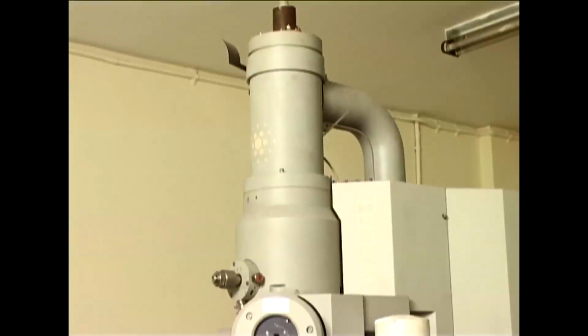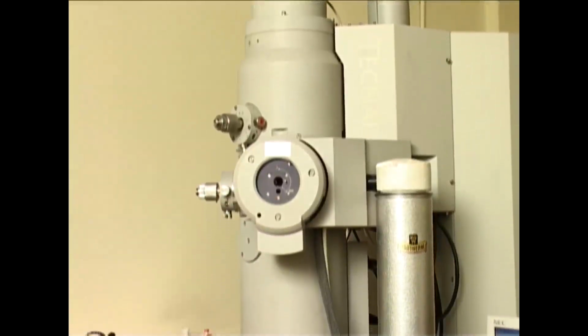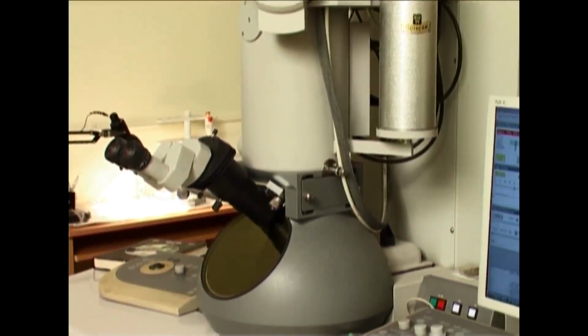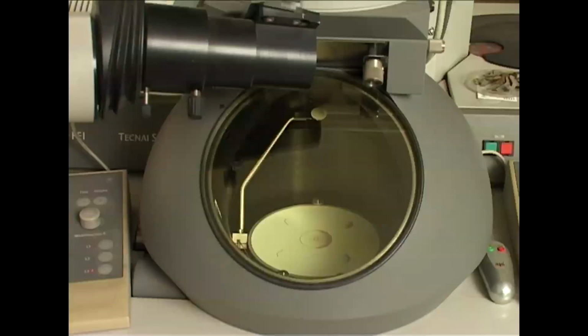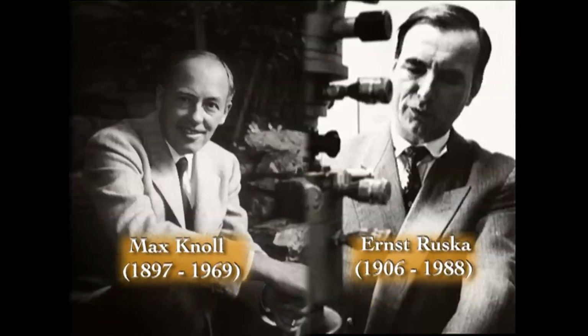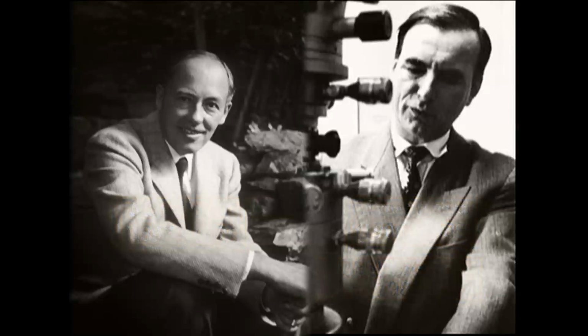A typical electron microscope will have an electron gun, due to which the electrons will come and impinge on the object, and then it will get scattered or get reflected from the object, and that can be focused by objective lenses and visualized on a fluorescent screen. The first prototype of electron microscope was made in 1931 by Ernst Ruska and Max Knoll. It was Ruska who received the Nobel Prize in 1986 in physics for his discovery of the electron microscope.